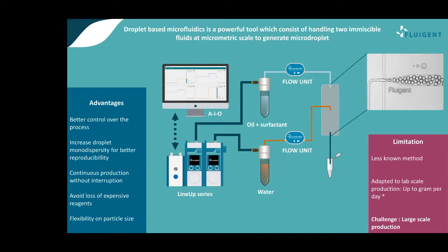It is adapted to lab-scale production for one single device. We are able to produce up to grams per day. However, large-scale production is another question, and this is one of the big challenges of microfluidics today.